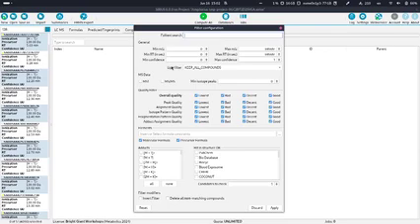Something you might want to do in the beginning is, I showed you already in this LCMS view, you have this traffic light system for the quality. And now you're also able to filter out features which have a very bad quality. I will explain this in more detail very soon. But what you can see in the middle is this quality filter. And here, if we go from right to left, this column which says good is the green circle, then decent would be yellow, bad would be the red circle, and gray would be the lowest, I hope.